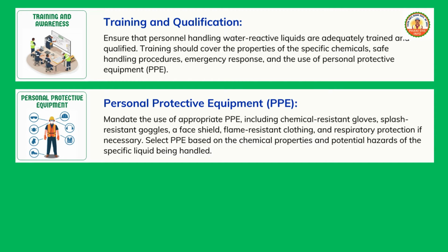Personal protective equipment, PPE. Mandate the use of appropriate PPE, including chemical-resistant gloves, splash-resistant goggles, a face shield, flame-resistant clothing, and respiratory protection if necessary. Select PPE based on the chemical properties and potential hazards of the specific liquid being handled.